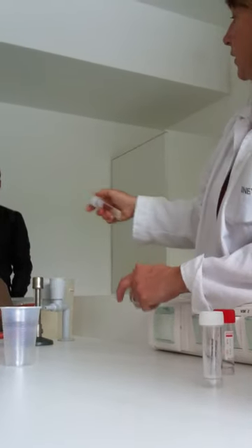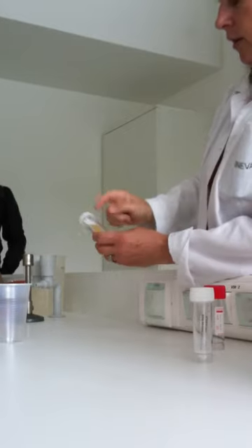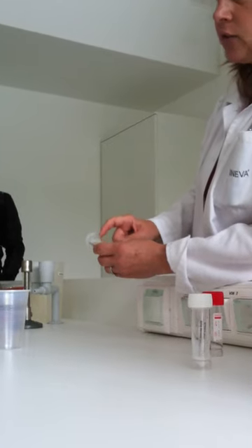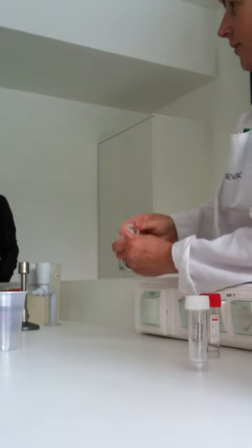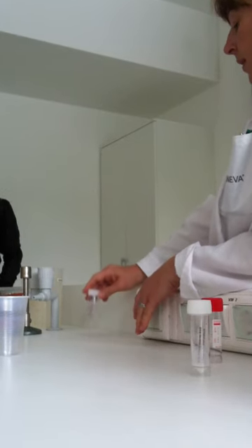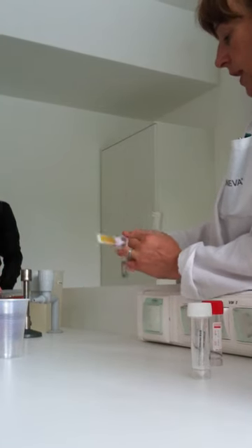And the staff are doing it and sending it to the lab? Yes, after it you can send it to the lab, but because it's a culture medium, if you keep it in the refrigerator, it's a big mistake, and don't say that in the final exam and don't do it during your practice. So keep it at room temperature. This is the best. And for culture, yes, because during this the bacteria will grow on the slide.